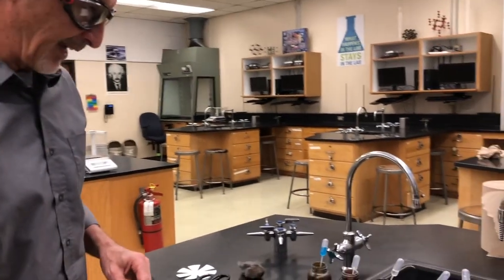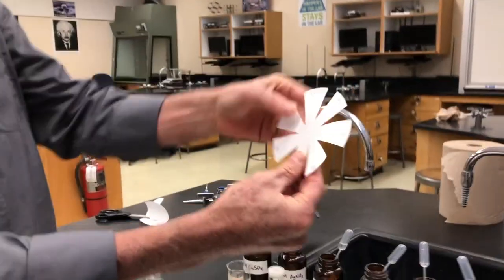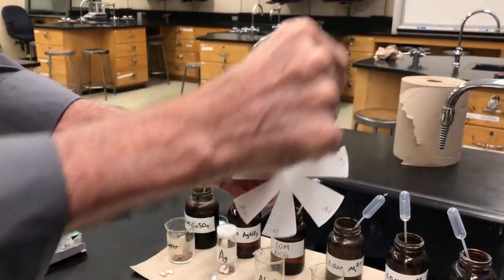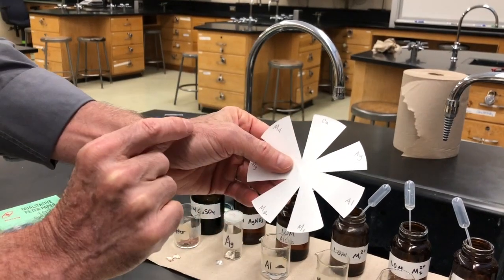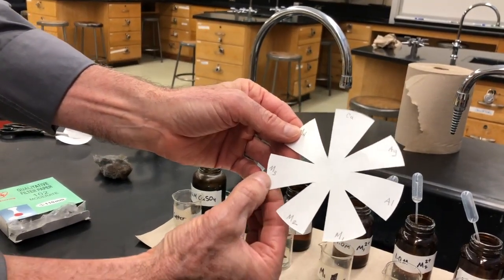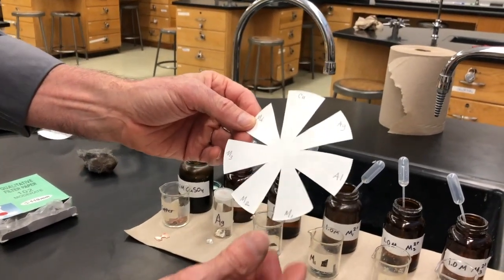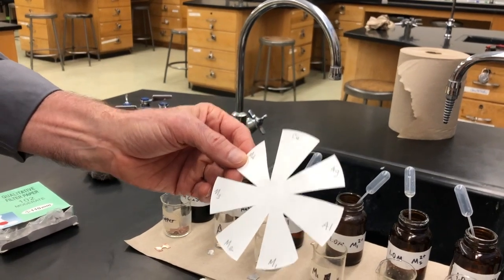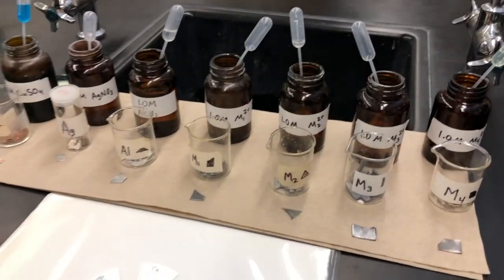Now we're ready for the second part, which is going to be a veritable multitude of microvoltaic cells. We're going to use the same procedure as before — filter paper as our beakers — and we're going to cut this into a seven-pointed star. Each one of these arms is going to be a beaker with, in this case, copper 2+ solution and copper metal, then silver, aluminum, unknown metal M1, unknown metal M2, unknown metal M3, and unknown metal M4. From our measurements you're going to be able to get reduction potential ordering and potentially identify what metals M1 through M4 might be.